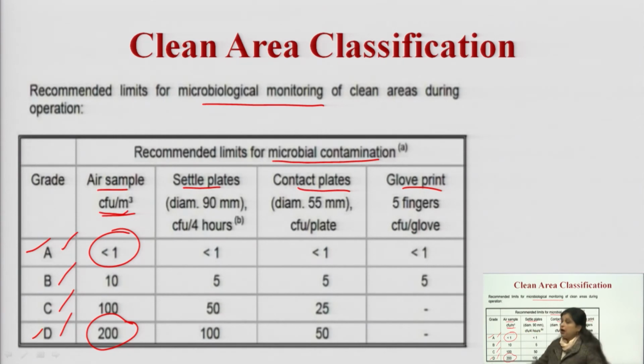These are all techniques for collecting air samples, to determine how many microorganisms are there within that air. We can go for settle plate techniques. We can take nutrient media and Petri plates, and place the Petri plate on any surface. The plate is open and contains nutrient media. If any microorganisms are present within the environment, they will come into the Petri plate, and when we incubate that settle plate in the incubator, it will generate colonies.